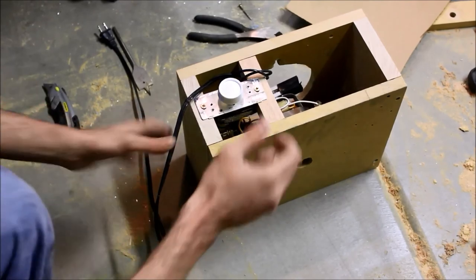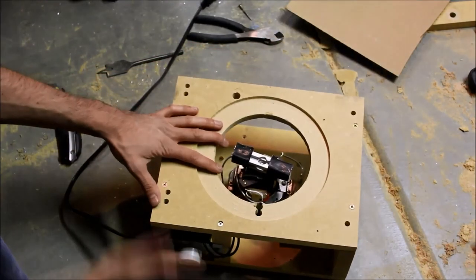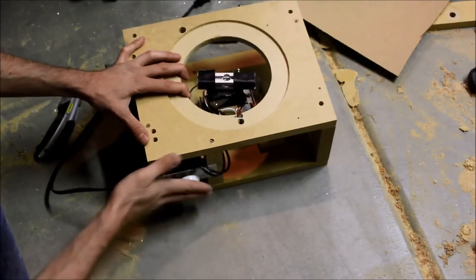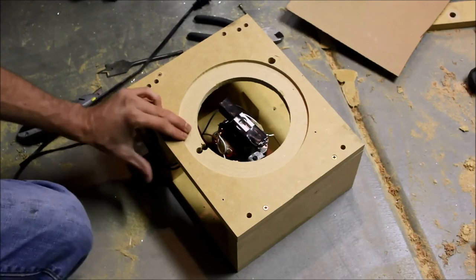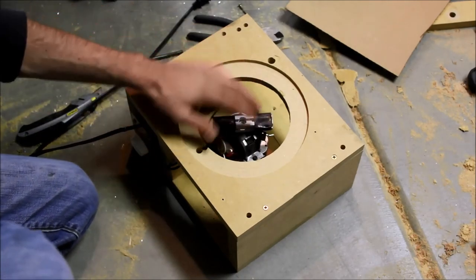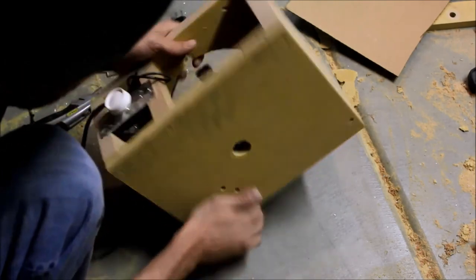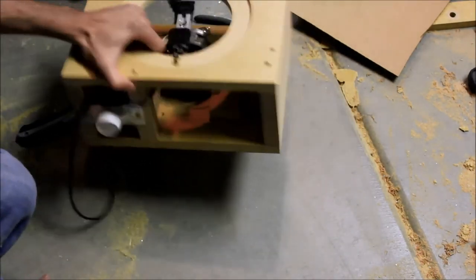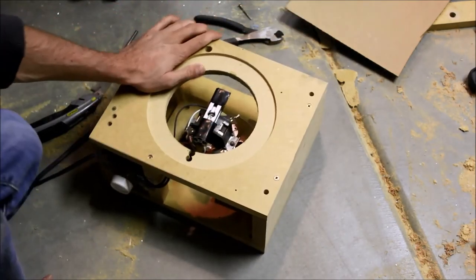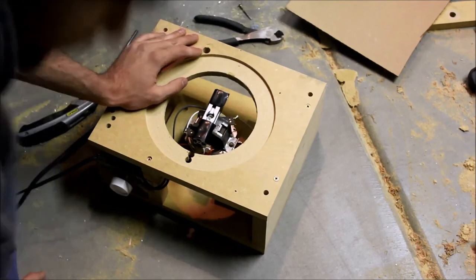And here it is, all done. So we've got the switch mounted up, which has on and off with a tap. We've got the thing freely spinning, with a hole on the bottom side so that it can spin. It's nice and solid, so I don't have to worry about it doing something bad. That's it. Done.